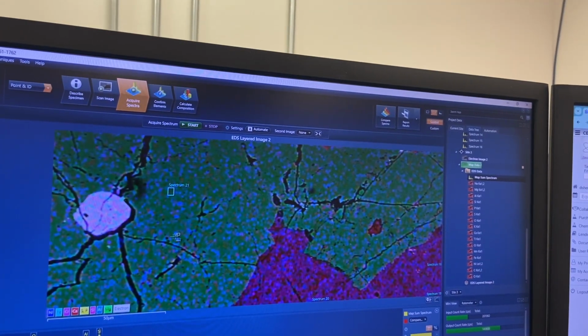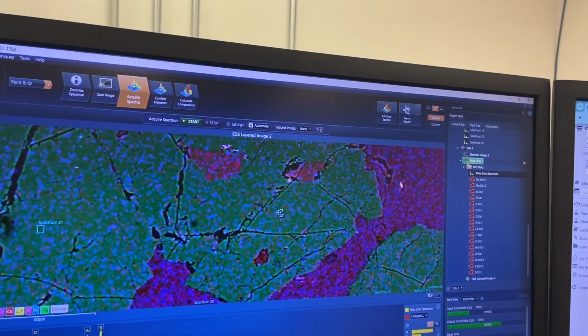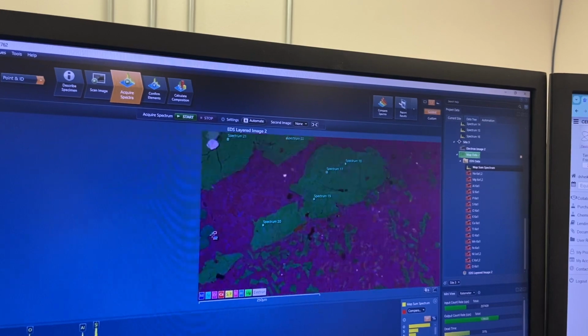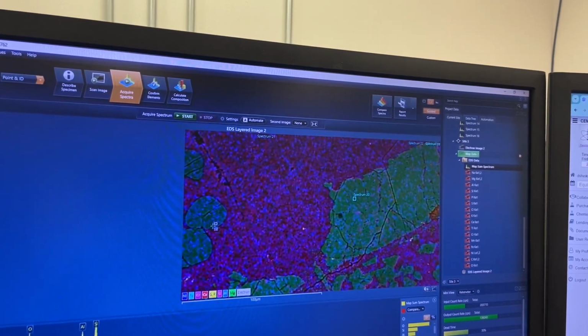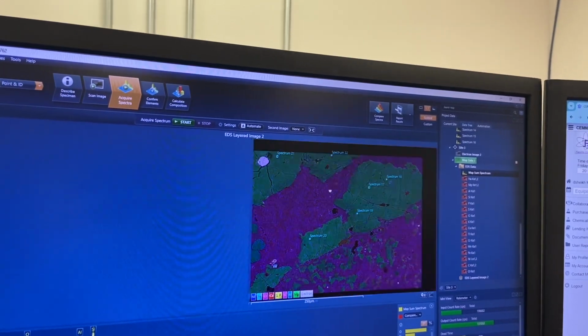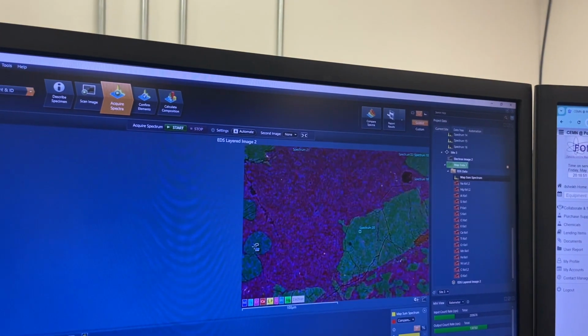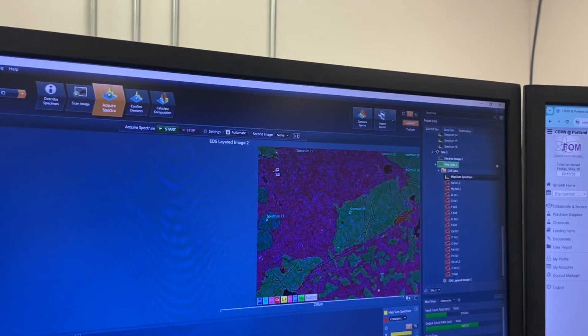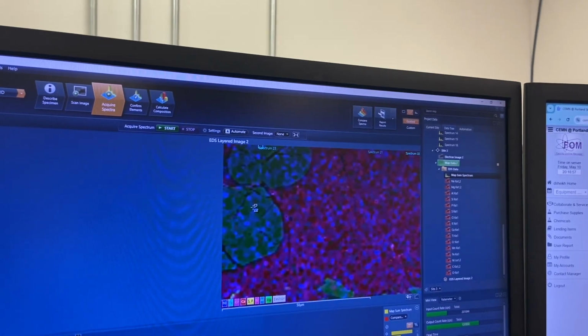No need to get the chromite. I already kind of know what the sample is. Oh, wait a second. Is that spinel? Do we have a pink spinel troctolite right here? Hang on a second. I actually... Yeah, it looks like... Let's see.